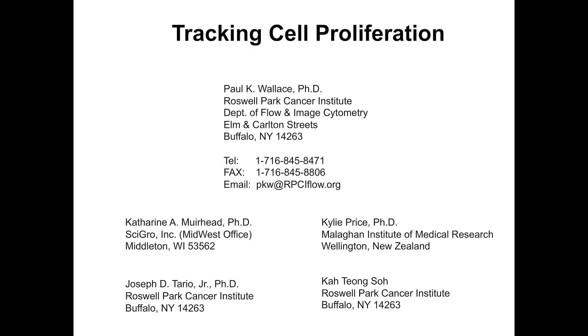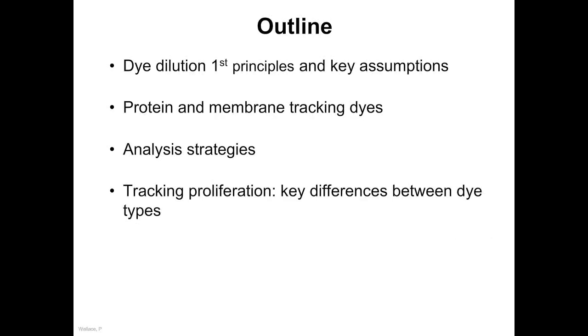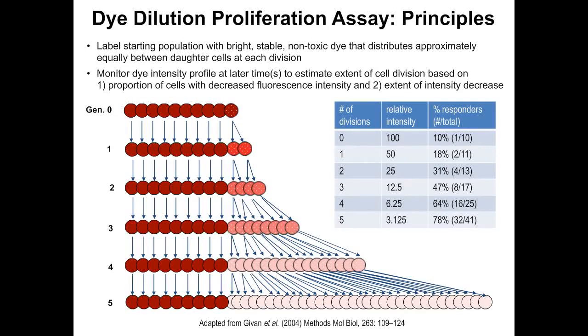So to begin, what I'm going to be talking about is sort of an introduction to what the dye dilution technique is and some of the key assumptions. We'll talk about differences between membrane and protein tracking dyes, just briefly discuss some of the analysis strategies, and then look at some of the key differences between the different dye types.